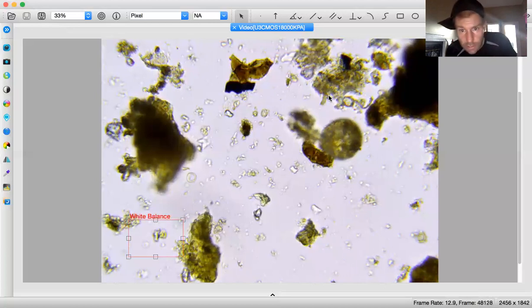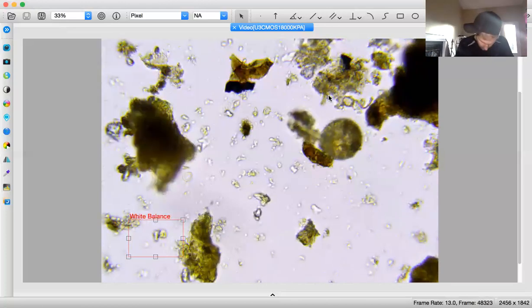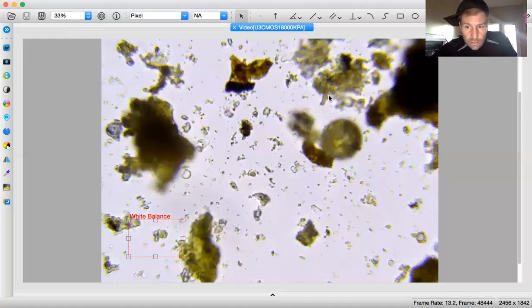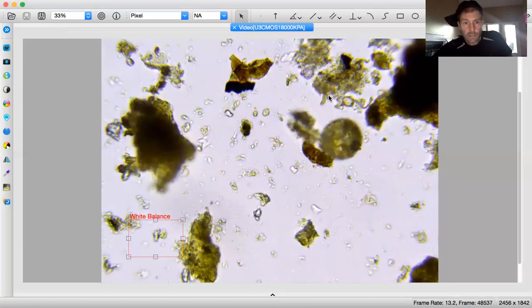Okay, and the diameter should be about 3.1, 2. I'm gonna say 3. Ooh. Nah, I missed him. So 3 micrometers. It's fungi, and it's 10. Okay, so I think that's that one I've already recorded in the corner down there moving around. So we're gonna just move on past that. All else is looking good.